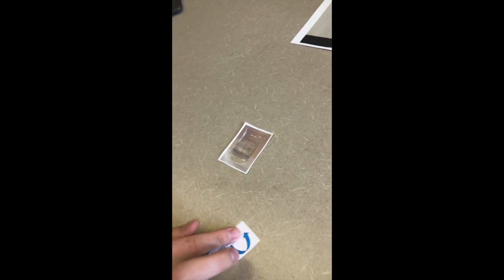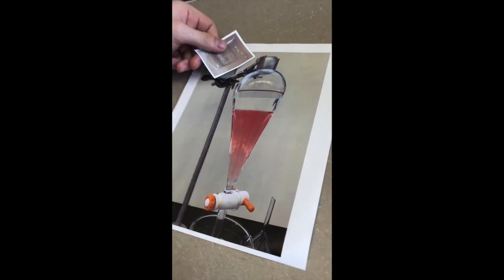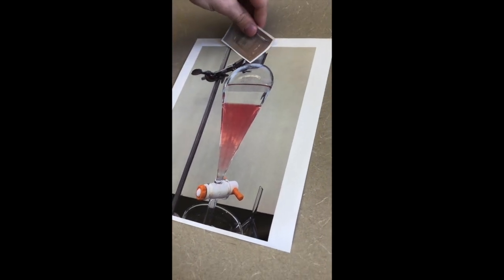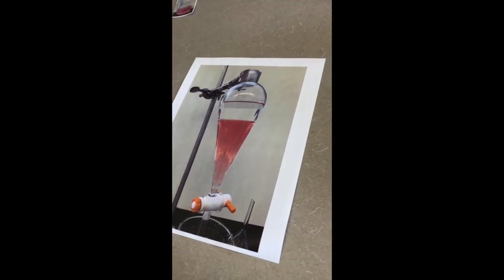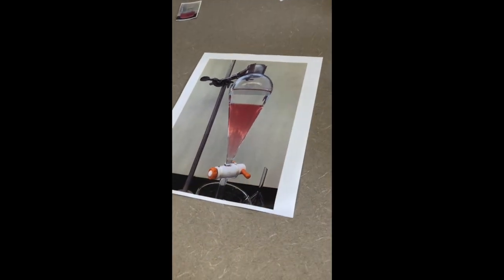So now we are going to do another round of adding some more sodium hydroxide. So let's add that base to the organic layer. And then we're gonna mix it around. And then we're gonna add it back to our separatory funnel and get another 2 layers and redo that process of draining out each layer. And then we'll be left with our water layer and organic layer.